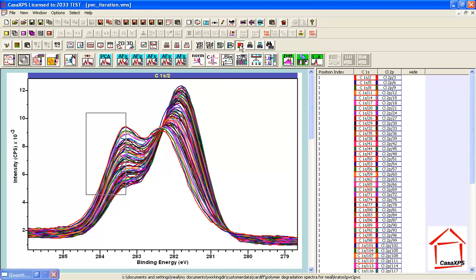If I click again, I get the angle. Well, there was no tilt with any of these measurements. Sputter time, well, it's identical to the etch time in the sense that no etching was performed. And then there's a date stamp. And now I have a sequence of values for the experimental variable that are indices that represent the individual measurements that were performed.